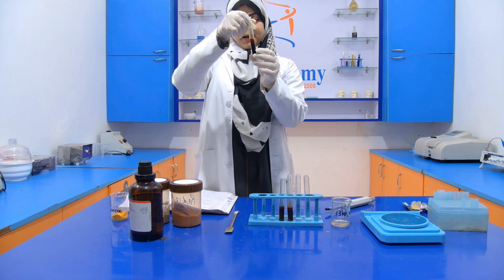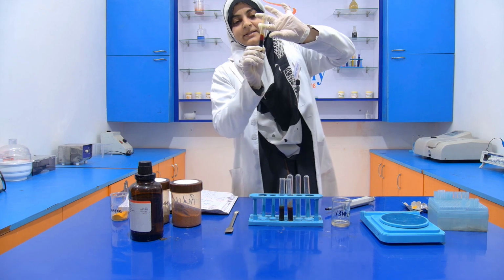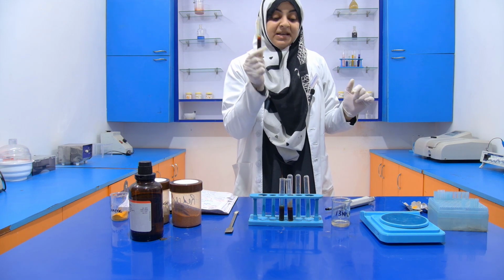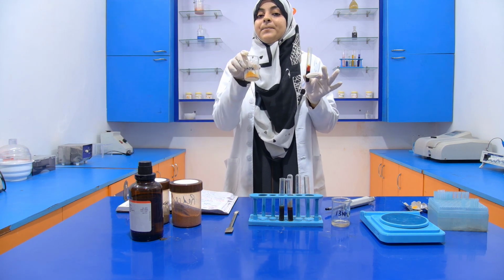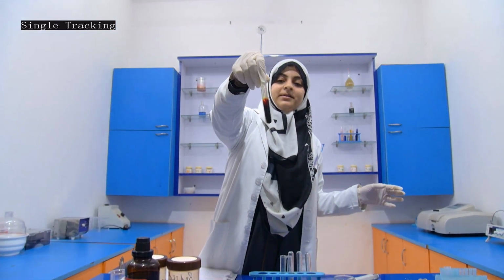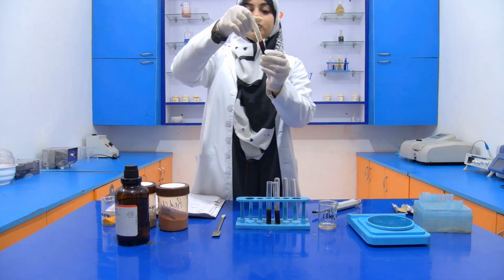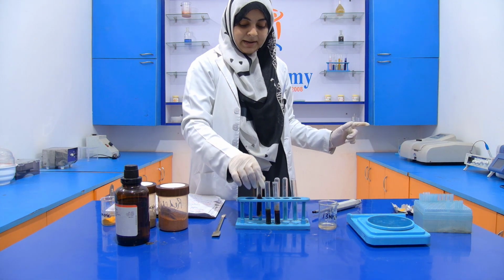Now you can see the result. This turmeric solution turned red, which means that our turmeric contains some coloring agent. You can see that red color. As soon as I added it, this red color appeared. That means that the turmeric is adulterated.